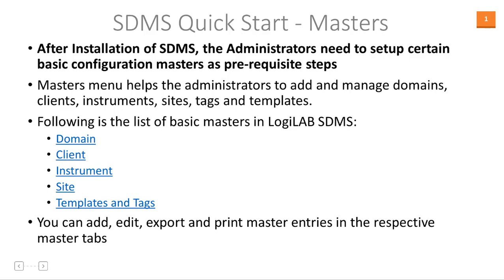Immediately after installation of the SDMS, the administrators will generally set up certain basic configuration masters. They are the prerequisite setups. This essentially consists of adding domains, adding clients, instruments, and mapping the instrument with the client, adding certain sites, and then there are certain templates and tags that need to be added and updated.